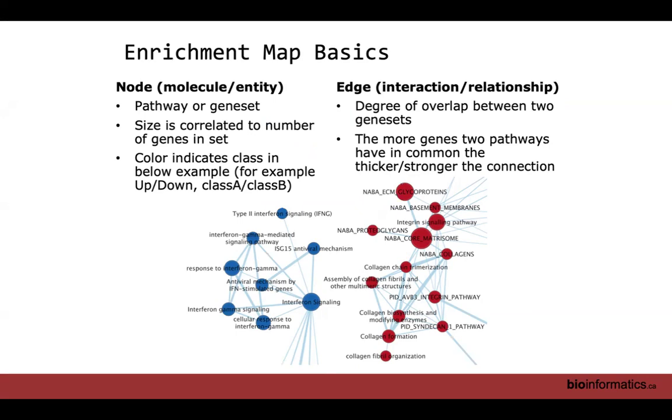And why is this important? Why do we do this? A lot of the pathway resources that we're using contain highly redundant information. There are lots of different pathway sources that we take from, and a lot of pathways have similarities, and a lot of the data that we're getting back is a little bit redundant, right? Meaning that you have multiple pathways that do similar things, but they're all coming up as enriched. So basically, the amount of information we have coming back is actually quite a lot.